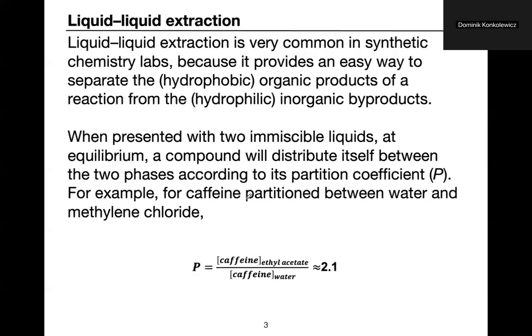Okay, so solid liquid extraction, the idea is we extract out the soluble components to liquid. The liquid-liquid extraction is a little bit trickier, and we have to think about a couple of different parameters.